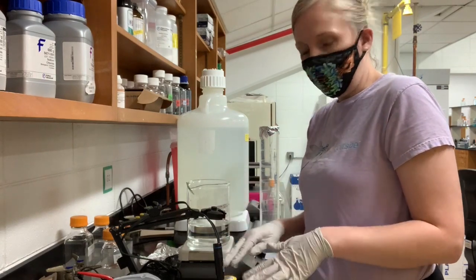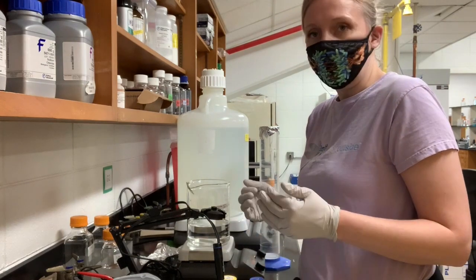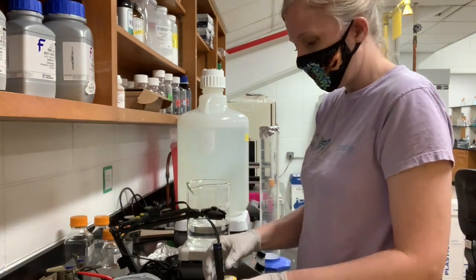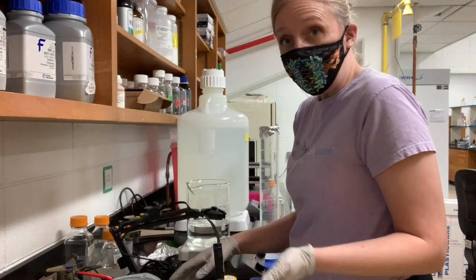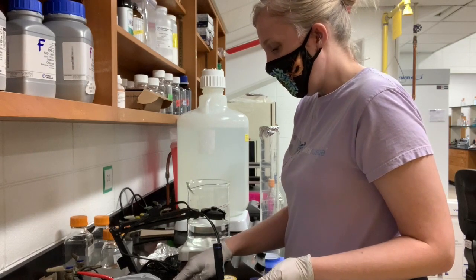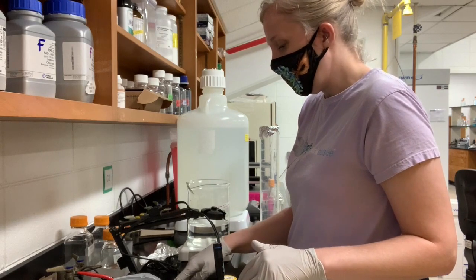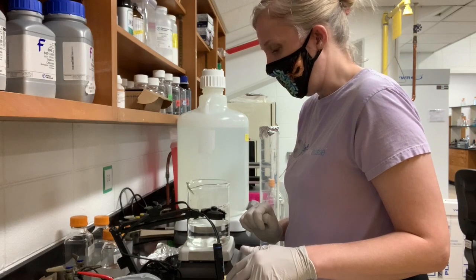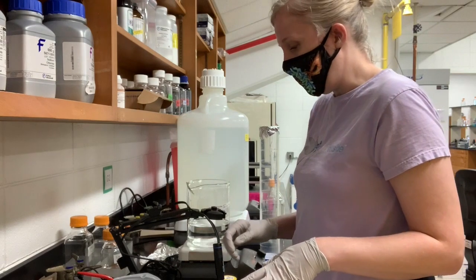It will know that you will be dropping it into 4, 7, or 10, and it will adjust whatever that reading is to the proper reading, so from 10.04 to 10. And so that has stopped blinking and says that the reading is stable, so I will hit accept. And that was F2. And then finally I'll have options that include calibration done, F3, and I will hit calibration done. And this will mean that the pH meter has been calibrated.